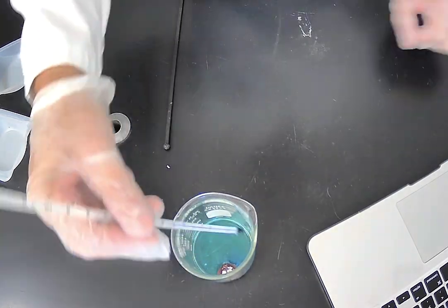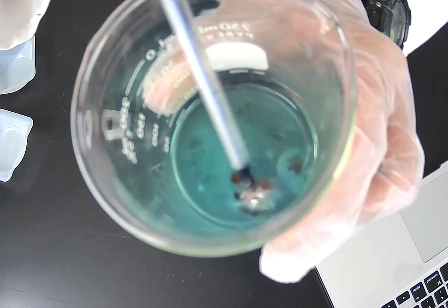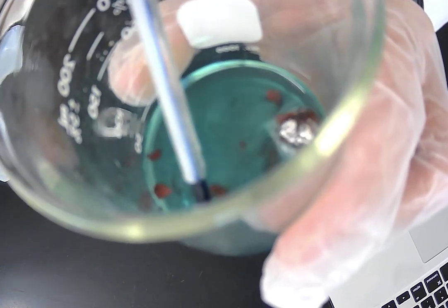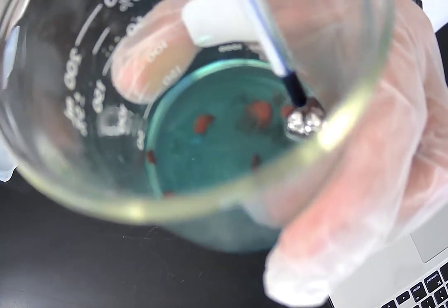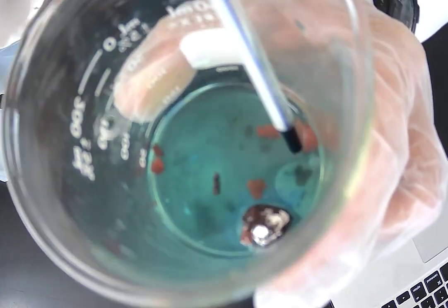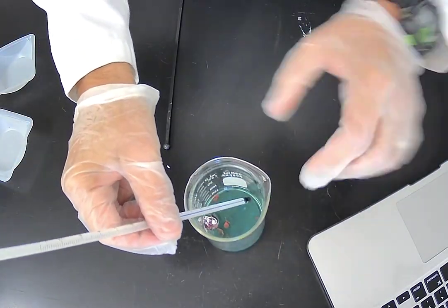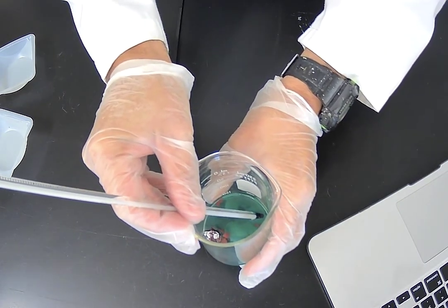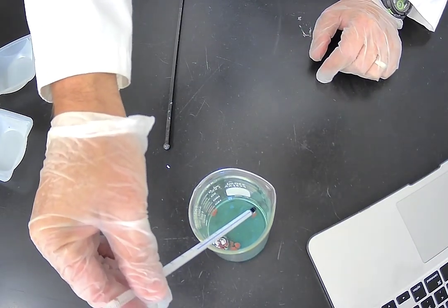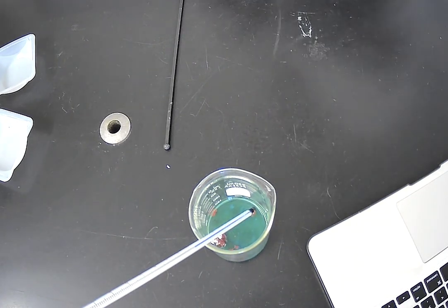Right, and once again, make some observations. I'm starting to see a brownish, almost a brick color substance forming. It looks like rust that's forming on the aluminum foil here. I'm also feeling that the bottom of the beaker is a little bit warmer than it was before I started. My temperature right now is 25 Celsius, so I only climbed up a degree.